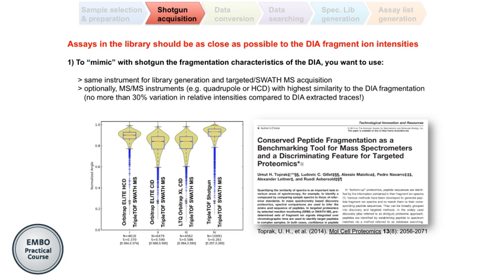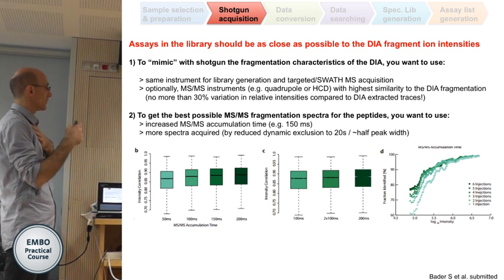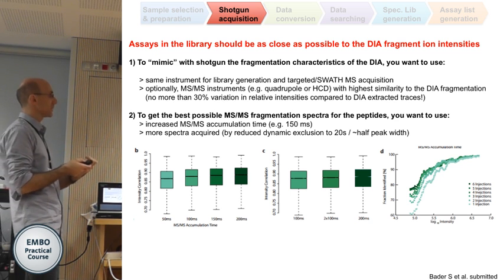It's a tool running in Python, where you can basically provide libraries and you can generate these plots very simply. And then you can compare libraries between each other to see how reproducible you are, how transferable you are between instruments. So you can have a look if you are interested. This was validated basically on the fragmentation level, and it was also validated by colleagues in Seattle. And you also see the influence of the fragmentation parameters that you use in your library creation.